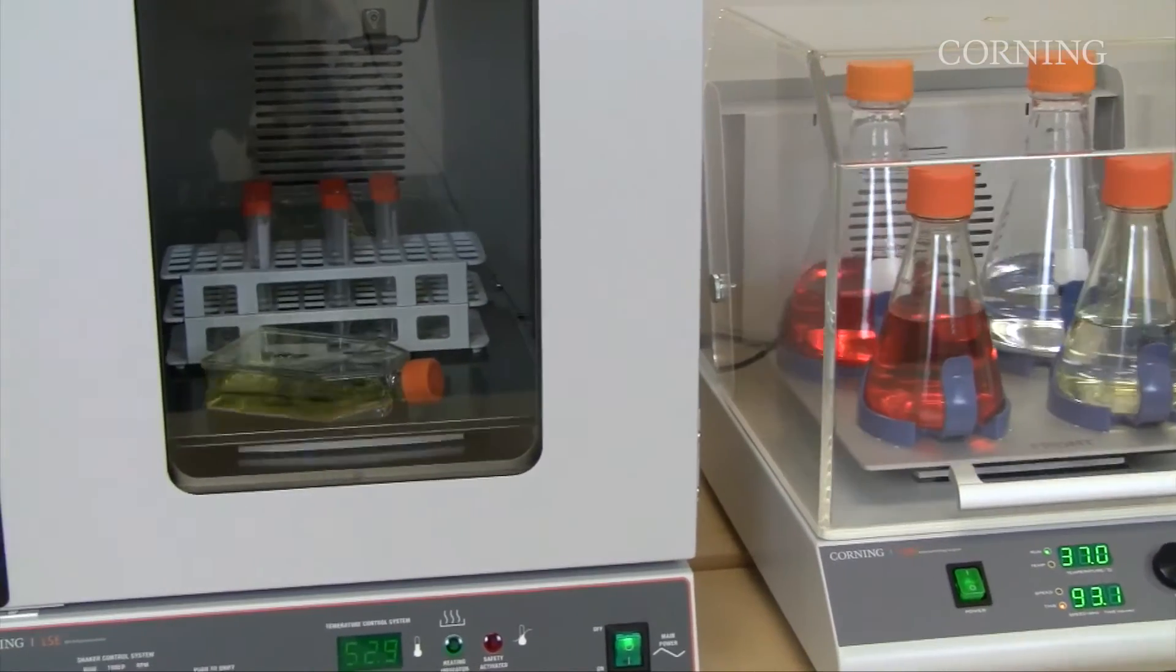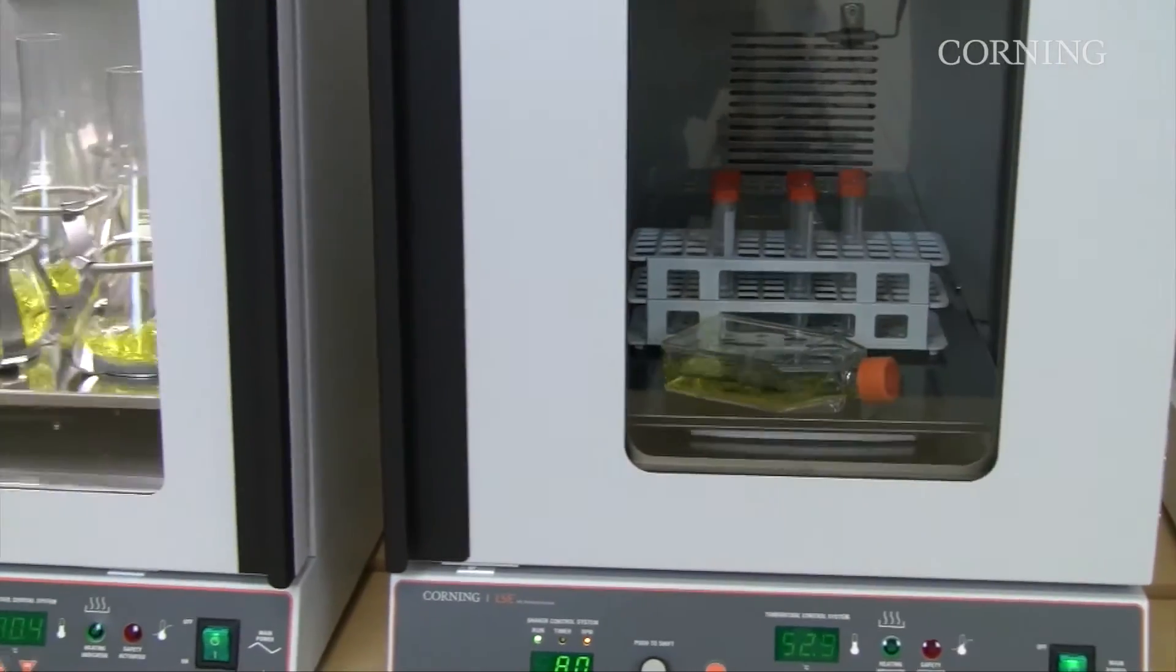Each model has a large viewing area, which allows for undisturbed monitoring of samples.